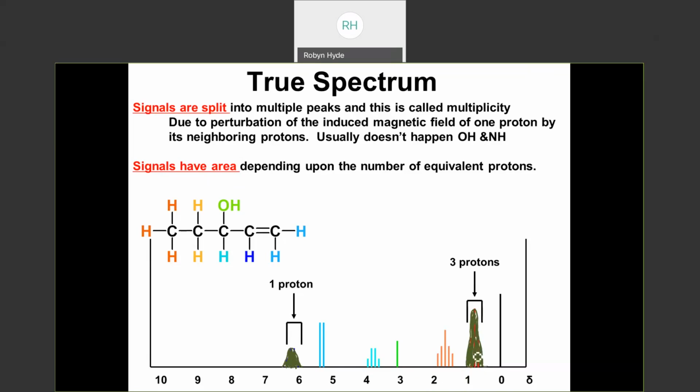Let's say that I cut out this shape right here, this first one at the chemical shift of 1, and I found that this had a mass of like 3.2 grams. And then I come out here to the chemical shift of about 6.5, cut that out, I massed it and found that this had a mass of like 0.85. These would be known as raw values, raw area values.